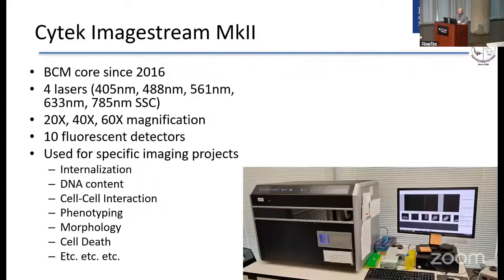Okay, so I'm going to be focusing on two instruments today, the Cytek ImageStream Mark II and the Attune CytPix, and some projects that highlight their use in the core. So let's start with the ImageStream.